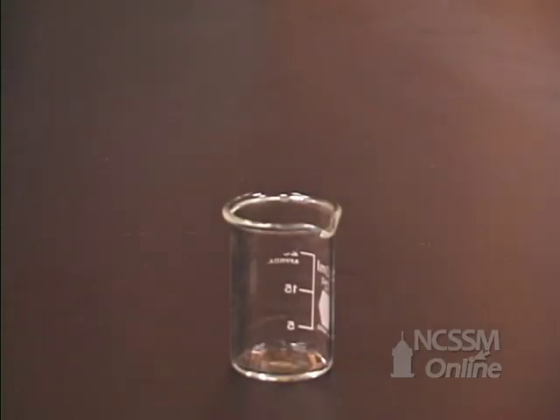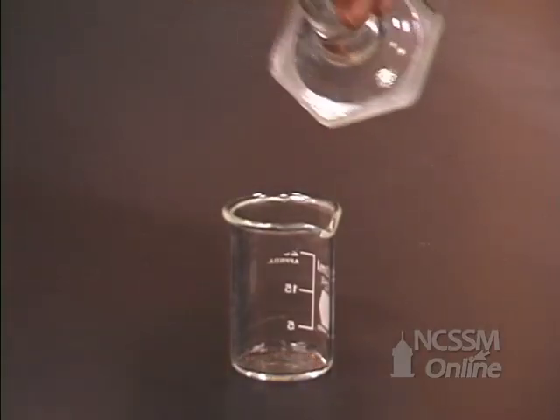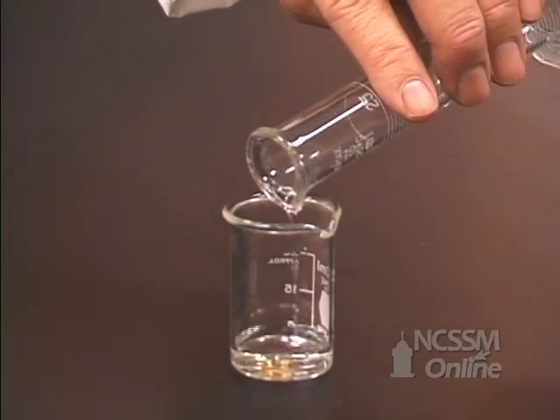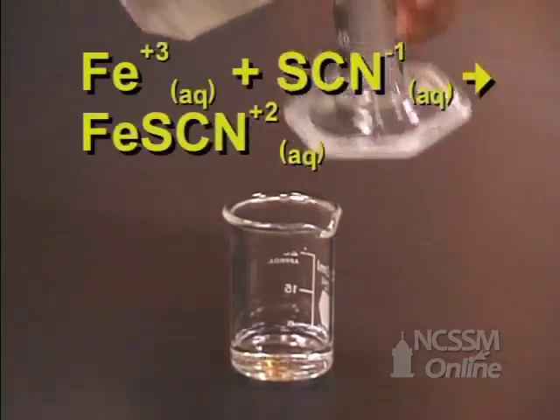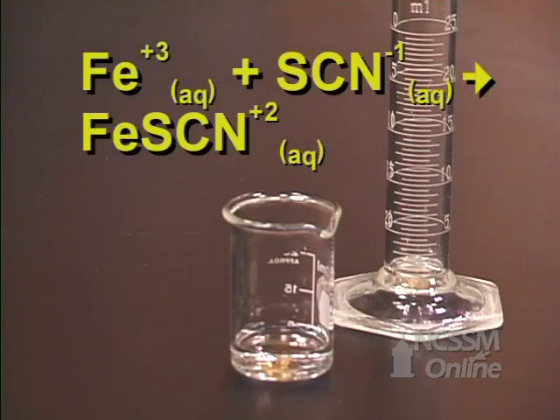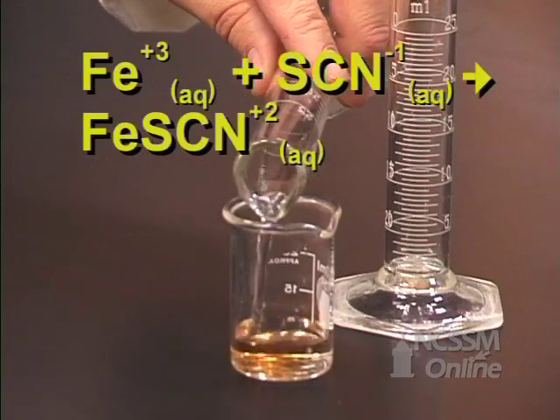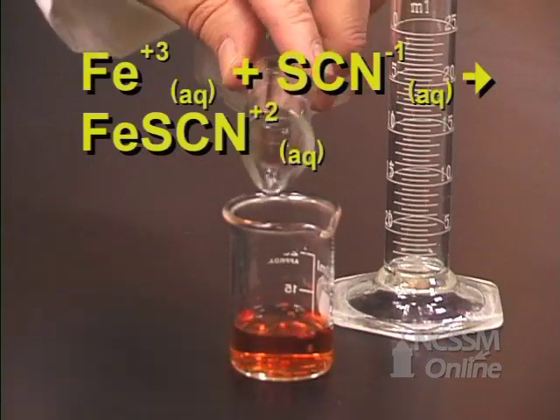After you have read the percent T of the standard solutions, you will prepare equilibrium mixtures of iron plus 3 and thiocyanate by pouring the iron plus 3 solution and the thiocyanate solution to a beaker.